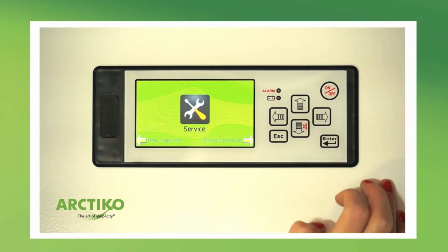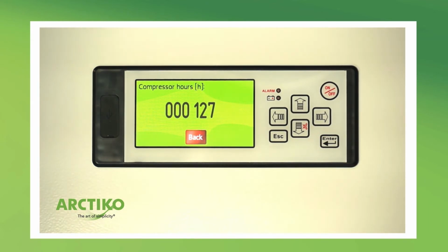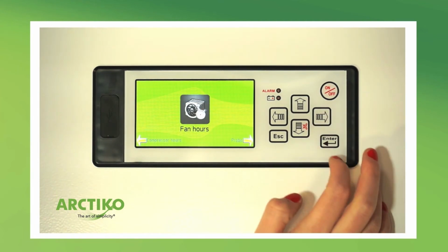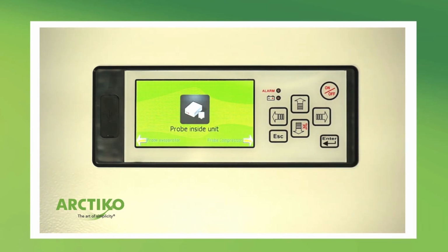Service menu shows important information about the service of the unit. Compressor hours shows how many hours the compressor has run. Fan hours shows how many hours the fan has run. Probe displays the temperature for the sensor mounted in the unit.